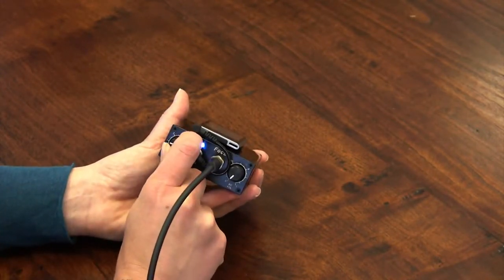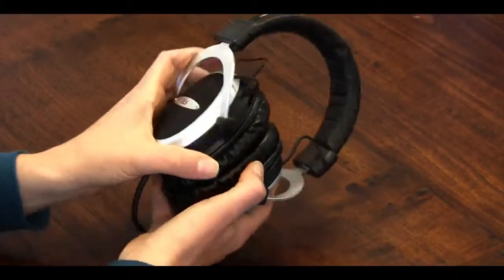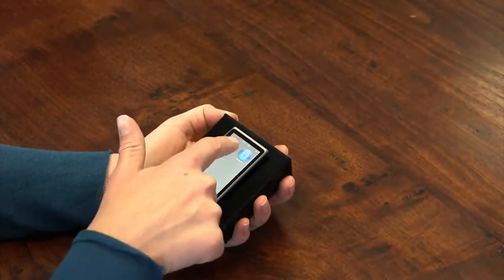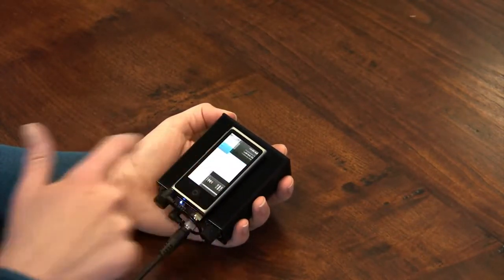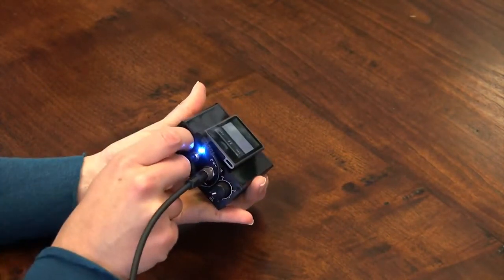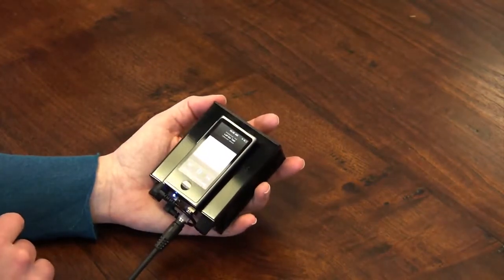First, let's check the air conduction. Turn on the amplifier and set the volume to 0.5. Take note that your headphones are labeled left and right, then put them on. On the iPod, press the music icon, select Playlists, Headphone Test, and then Air Conduction Test. Select Left Ear Test, and music will begin playing in the left ear only. You may need to adjust the AC volume to hear it depending on your level of sensitivity.